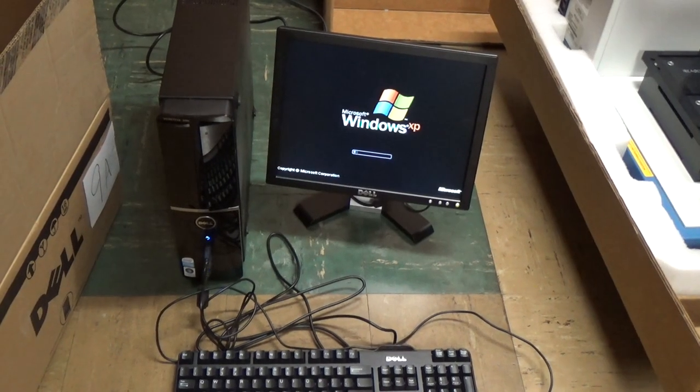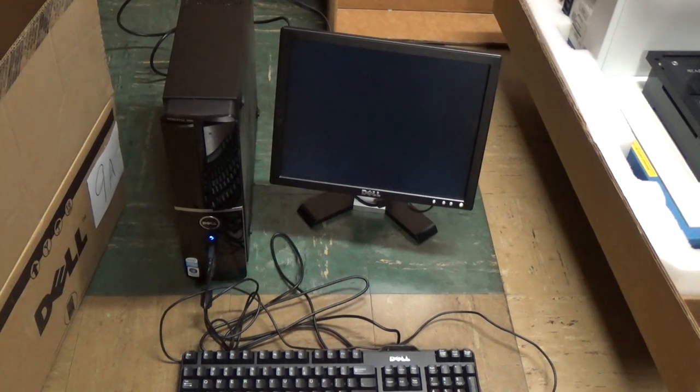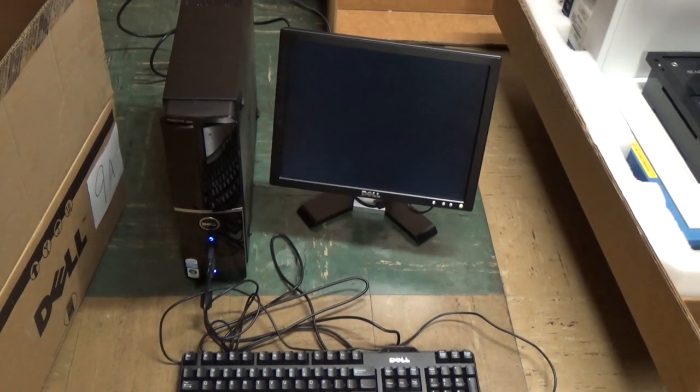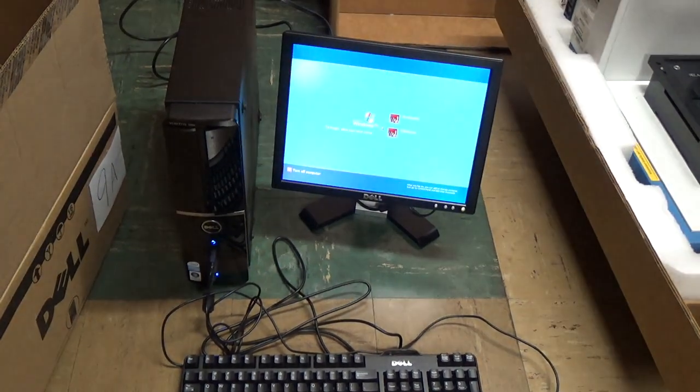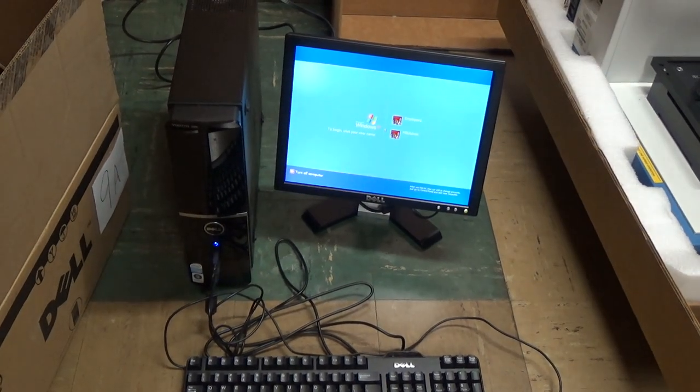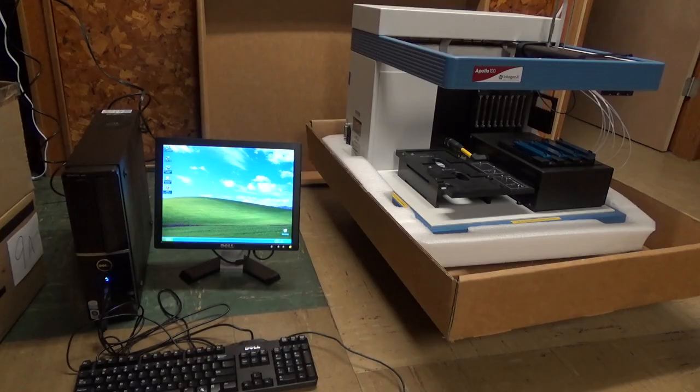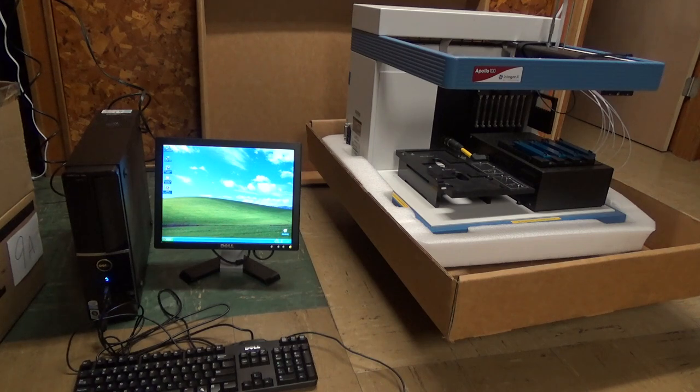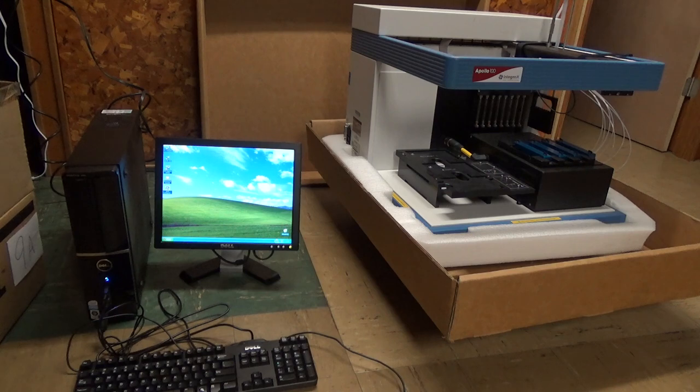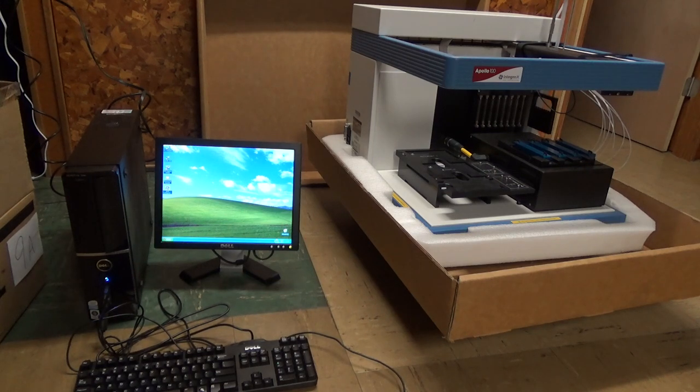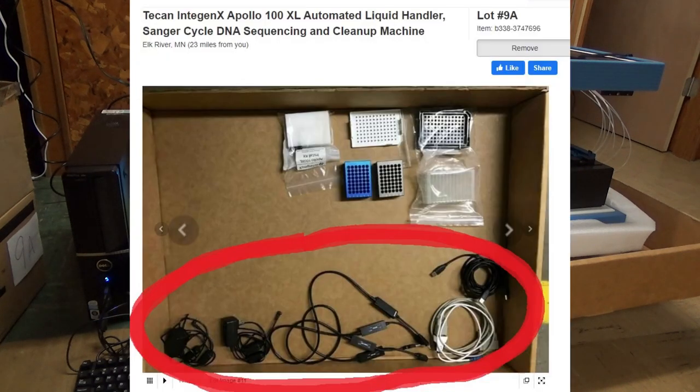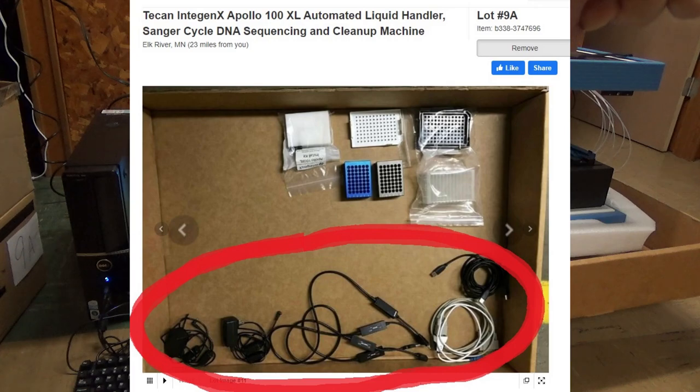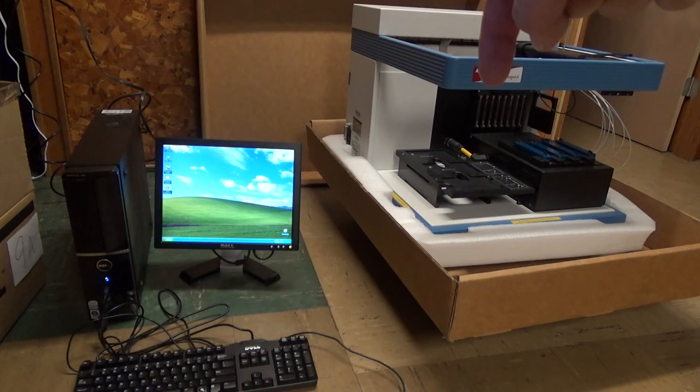Oh, thank goodness. I was worried it was really going to be Windows Vista, but fortunately, it's the good one. Okay, so as I'm setting this up in my attempt to open the Cretaceous Resort, I'm realizing that the auction company forgot a few things. There are definitely supposed to be some cables that go from the computer over to our Clonomat here.